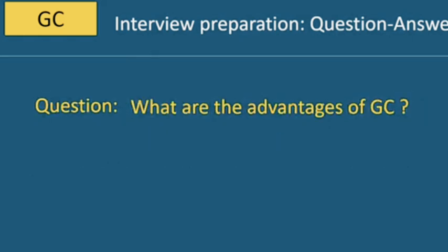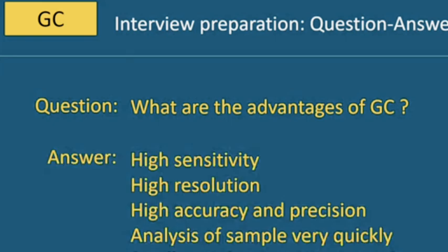What are the advantages of gas chromatography? These are the advantages in gas chromatography: high sensitivity, high resolution, high accuracy and precision, analysis of sample very quickly, small sample quantity required.